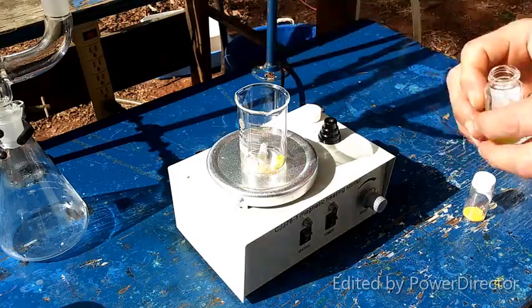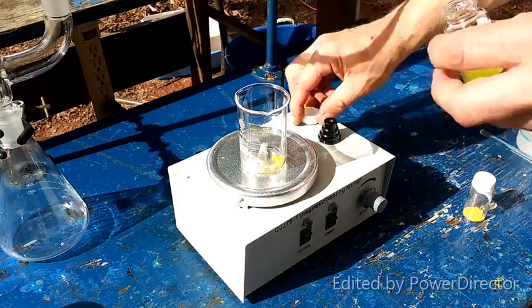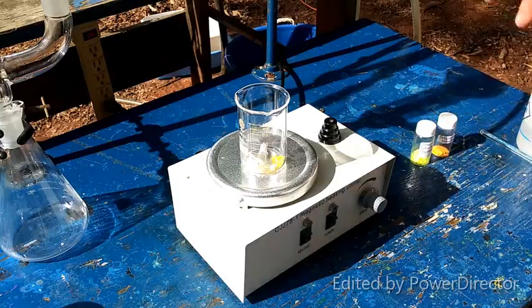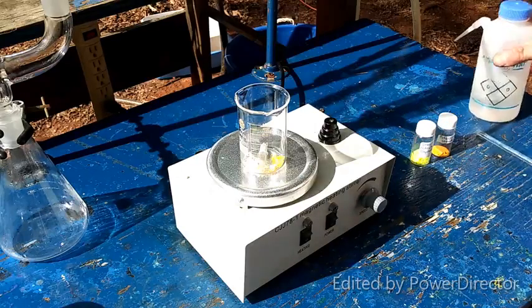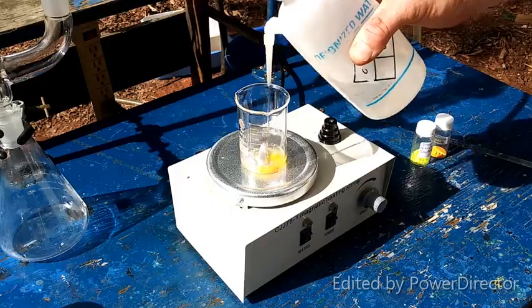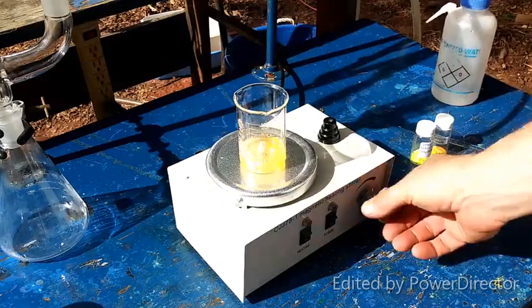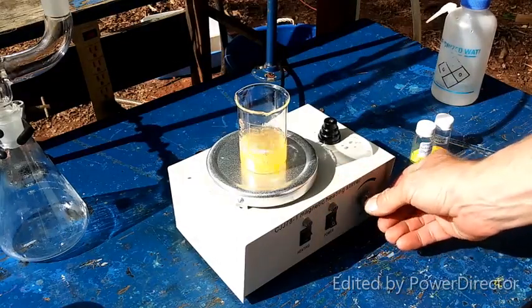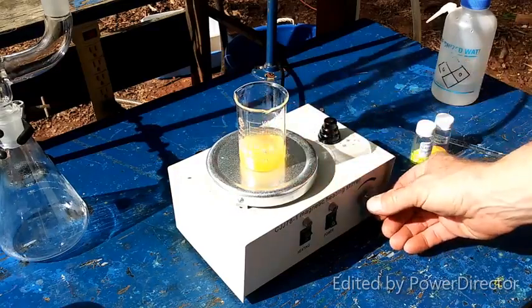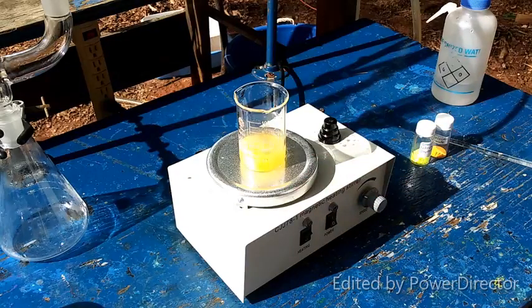Okay? Just a tiny little bit more maybe. Well, okay, whatever. Yeah, the proportions are, who knows? Like I said, it just says to use alkali uranate with an excess of uranyl nitrate or sulfate, so I have no actual idea what the proportions are really supposed to be. But, I mean, it works out. And I didn't have any issues with it when I tried it. So we're going to let this stir now until everything goes into solution.